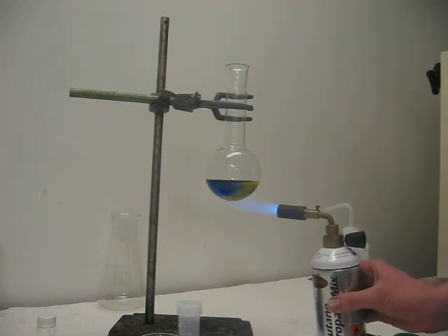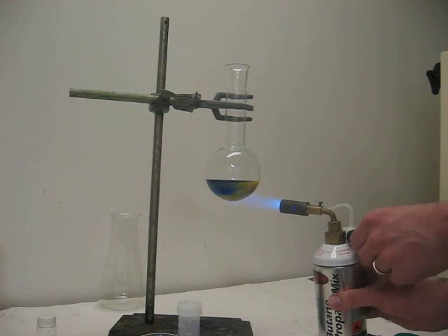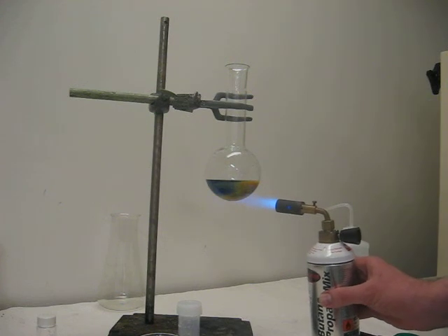Now, I am hoping you can see at home that an orange solid is forming in the flask.